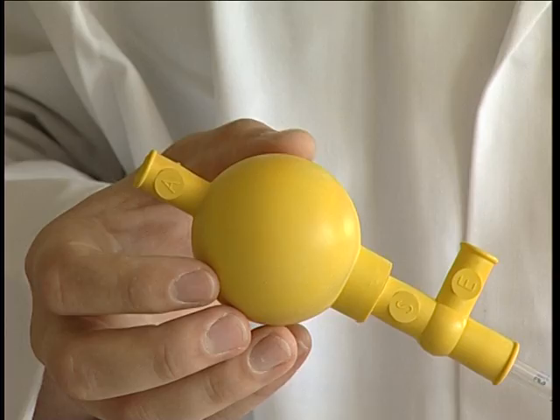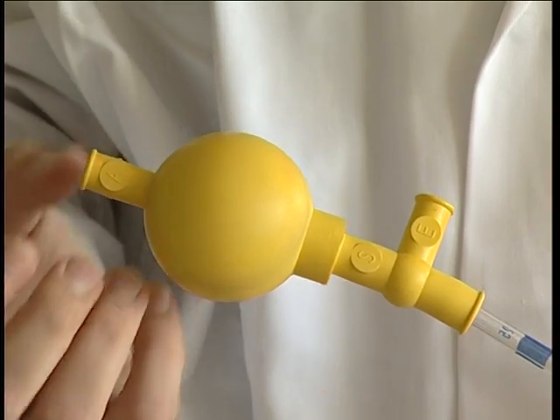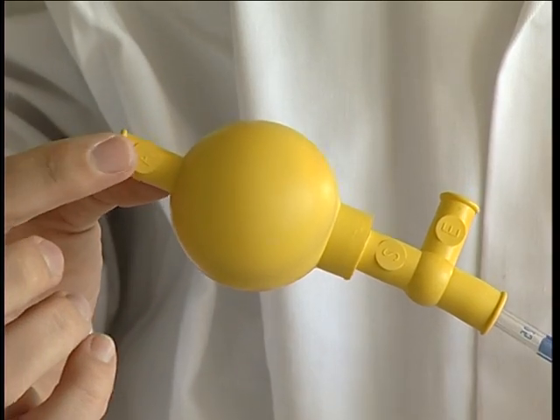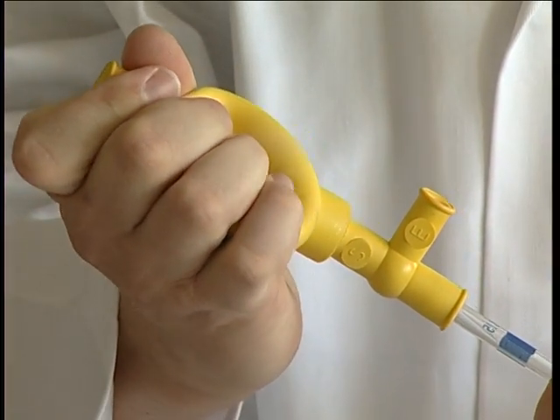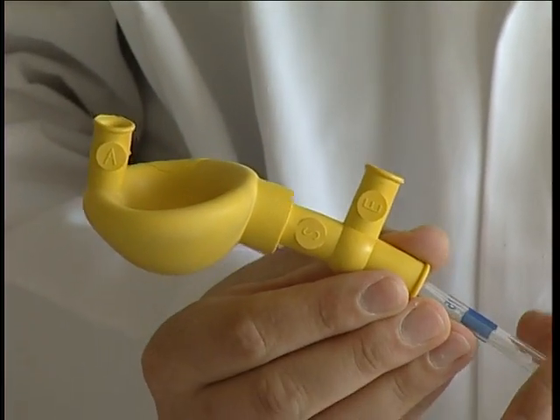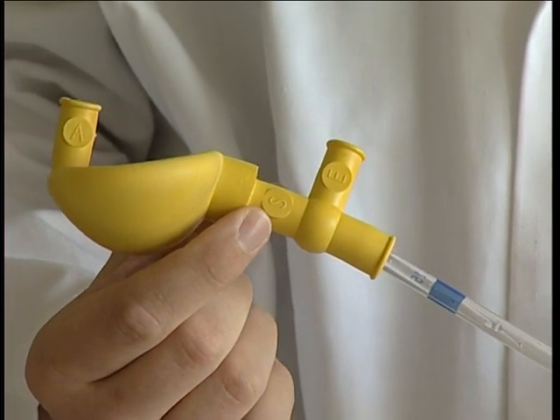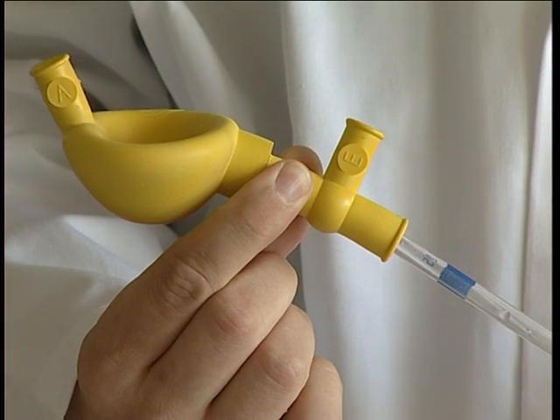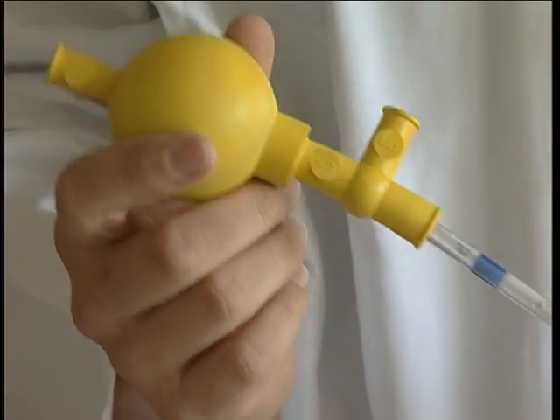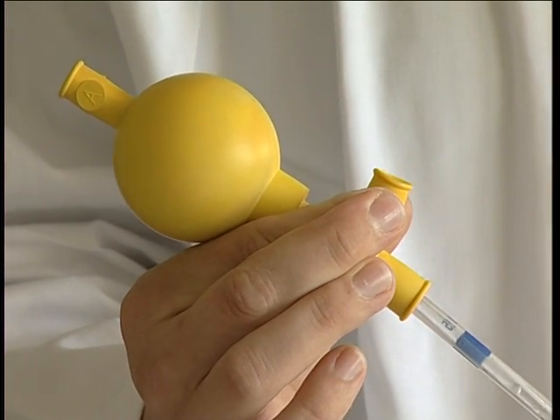With the pipette filler attached, we have three buttons: A at the top, S and E. To start with, we need to evacuate the main bulb. We can do this by squeezing together the A button and then depressing the bulb — that forces the air out of the A channel. In order to get the liquid to come up the pipette, we then submerge the pipette into the liquid and press S. By pressing S, the liquid is drawn into the pipette. In order to dispense the liquid from the pipette, we press the E button. Just squeezing it together would allow the liquid to run back down.